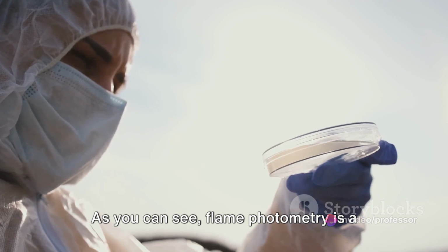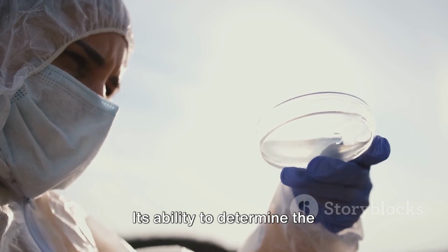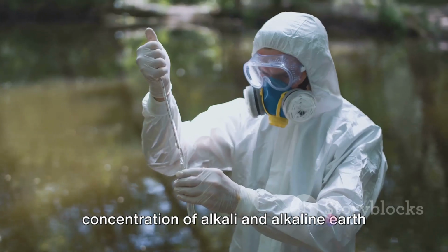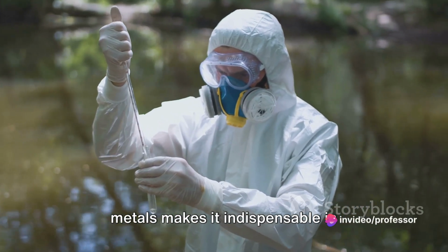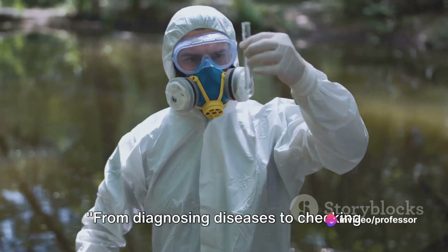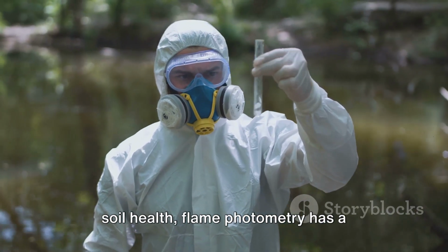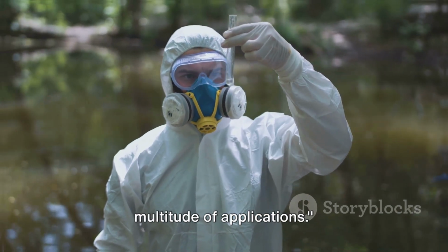As you can see, flame photometry is a powerful tool in many different fields. Its ability to determine the concentration of alkali and alkaline earth metals makes it indispensable in everything from medical diagnoses to environmental conservation. From diagnosing diseases to checking soil health, flame photometry has a multitude of applications.